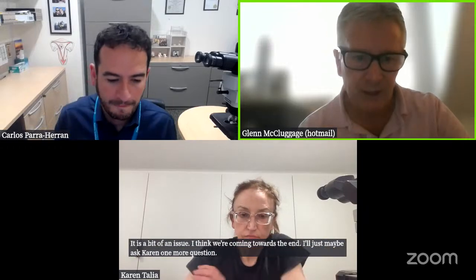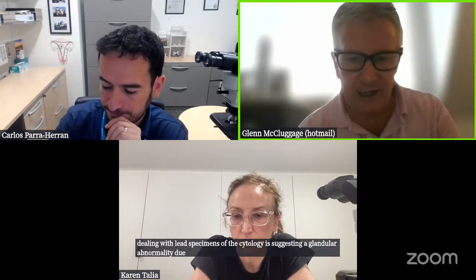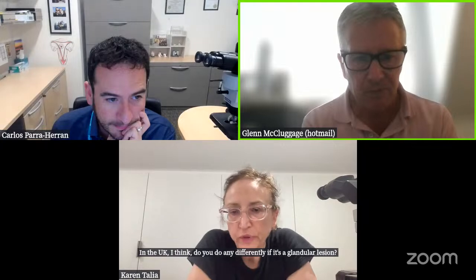I think we're coming towards the end. I'll just maybe ask Karen one more question. It's really about dealing with LEEP specimens. If the cytology is suggesting a glandular abnormality, do you deal with the LEEPs in a different way, or do you still do the parallel approach, which we kind of do in our institution and most places in the UK? Do you do anything differently if it's a glandular lesion? No, we don't do anything differently.